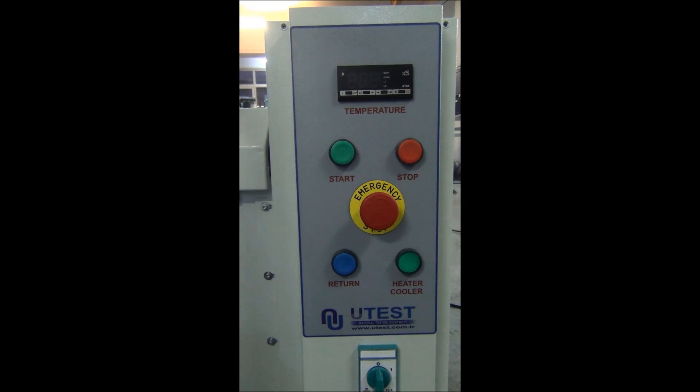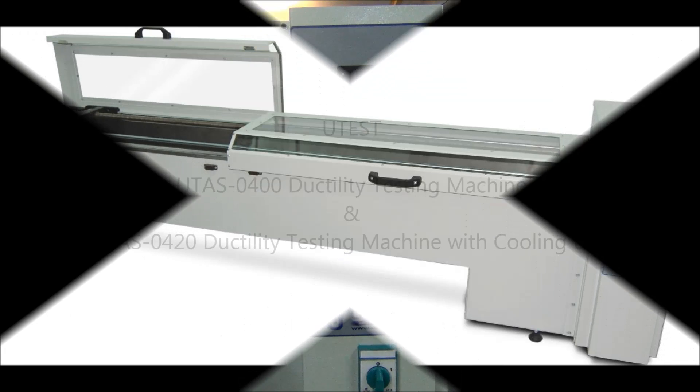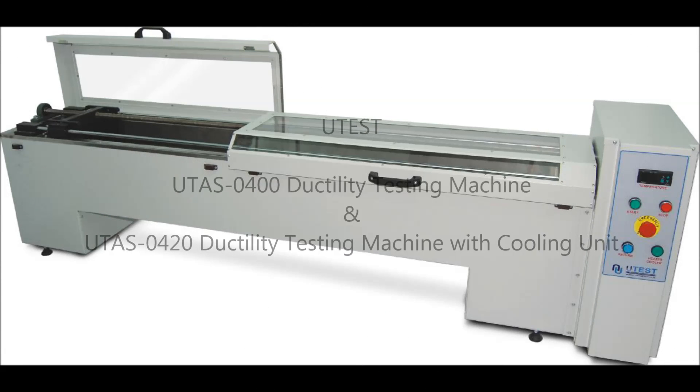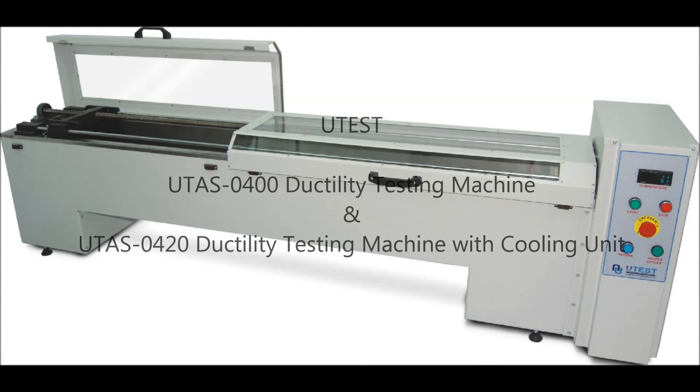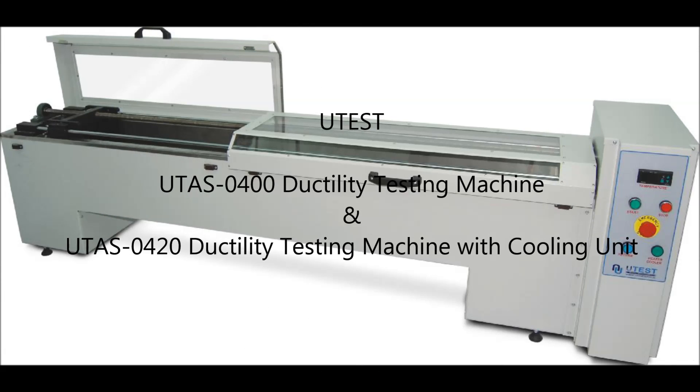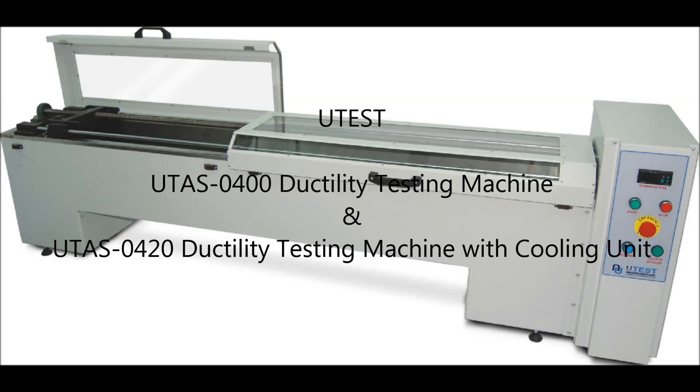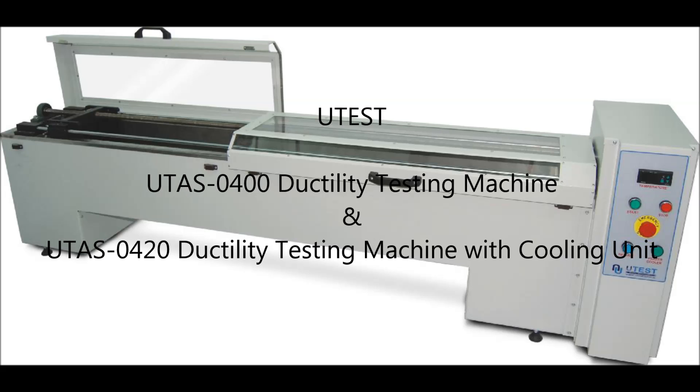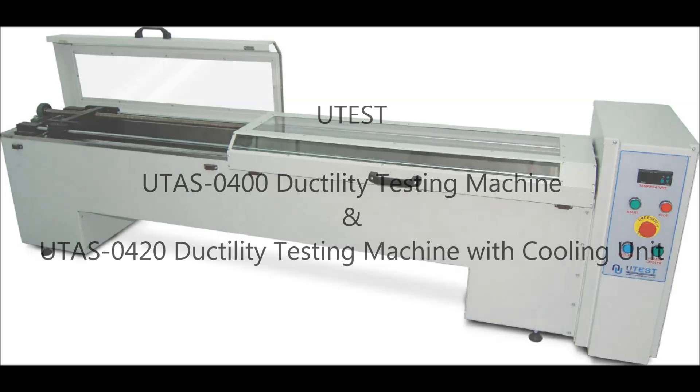The UTAS-0420 ductility testing machine with cooling unit.